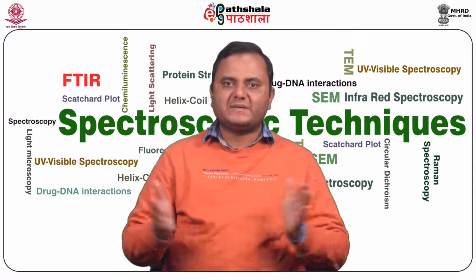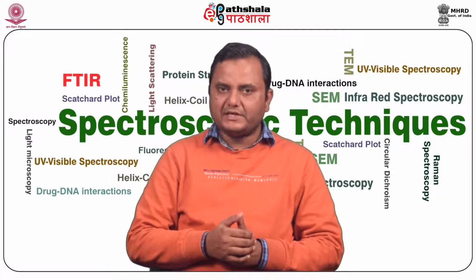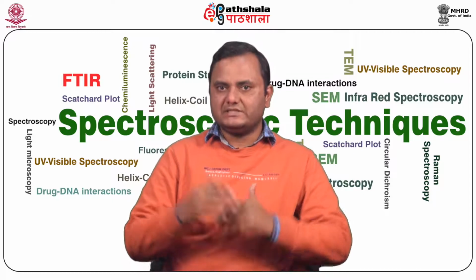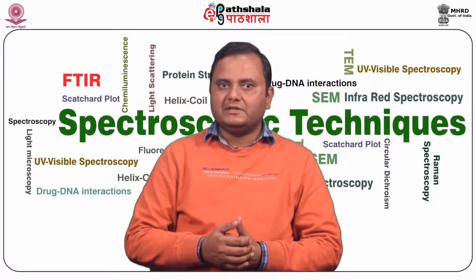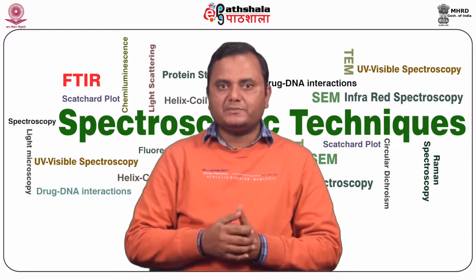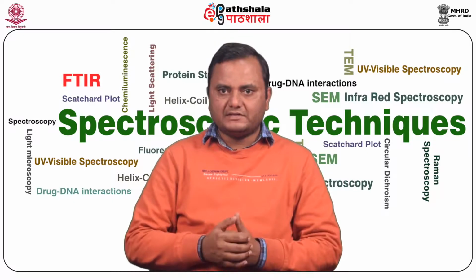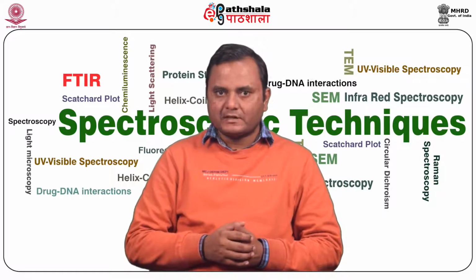Any compound which absorbs in the region of 250 to 190 nanometer should be avoided, because in this region the protein gives its own information. A buffer, detergent or other chemical should not be used unless it can be shown that the compound in question will not mask the protein signal.